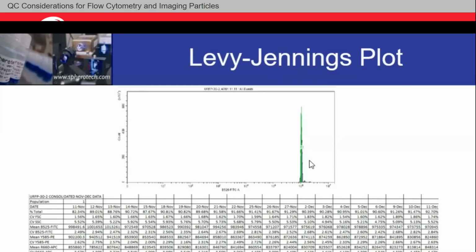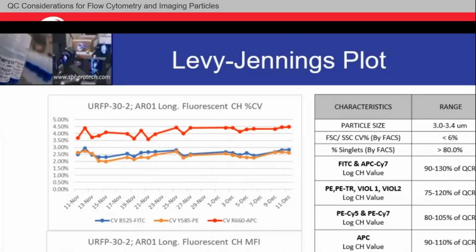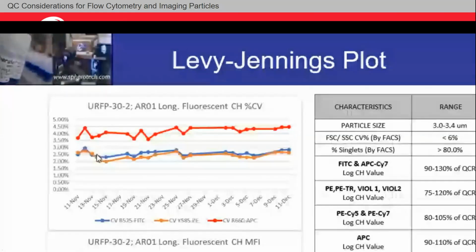Now, don't jump to conclusions in your first 2 or 3 days of gathering data, as we'll see. In those first 2 or 3 days, you're not always sure what's going to happen, but there should be a normalization, and the numbers may also get better as you continue to run the instruments. They also tend to have kind of a trend, especially if they're coming off the same laser, especially if they have a similar filter. There should be a similar trend.